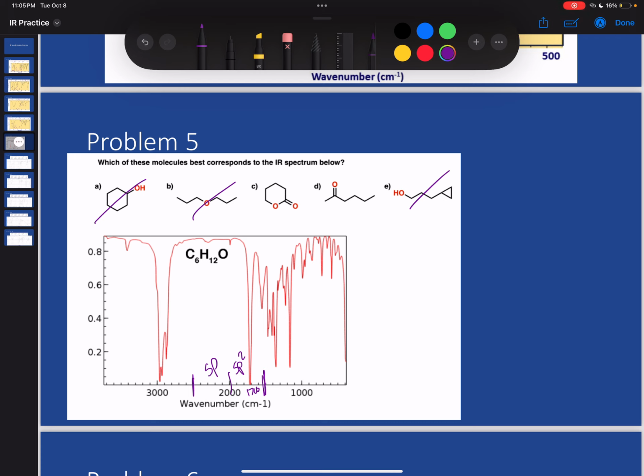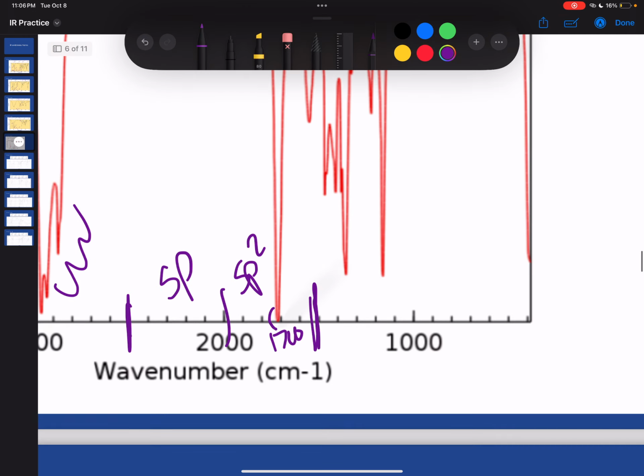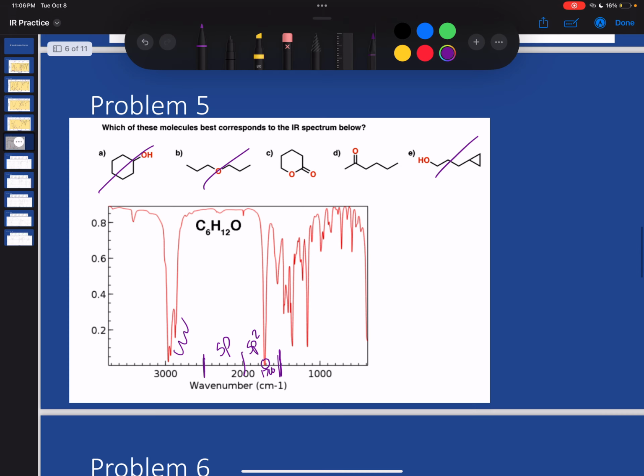So this is actually very difficult to interpret because other than that carbonyl, there's nothing else that I would expect to see. Now, I have my hydrogens here, sure, but all of the hydrogens in both of these structures are on carbons that are sp3 hybridized. So that's not going to tell me a difference here. The only thing that I might look at is where that carbonyl peak is showing up. And so I can see if I zoom in that it is slightly above 1700. Even that's not very helpful.